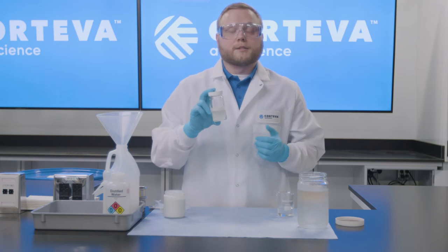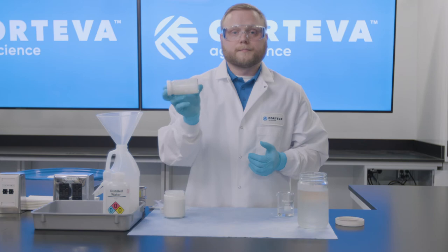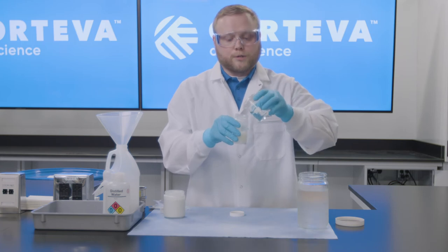Now, to simulate some agitation in the spray tank, we're just going to give this a few inversions, then we'll add the rest of the volume of the UAN 32.